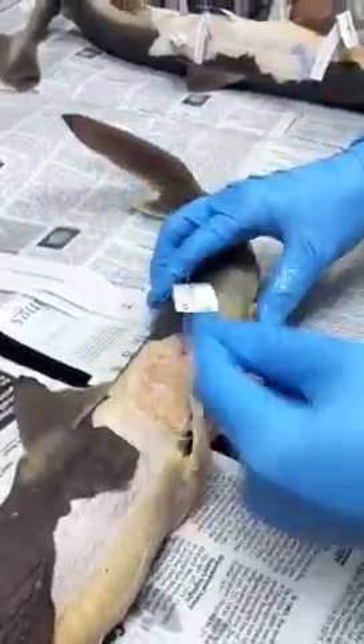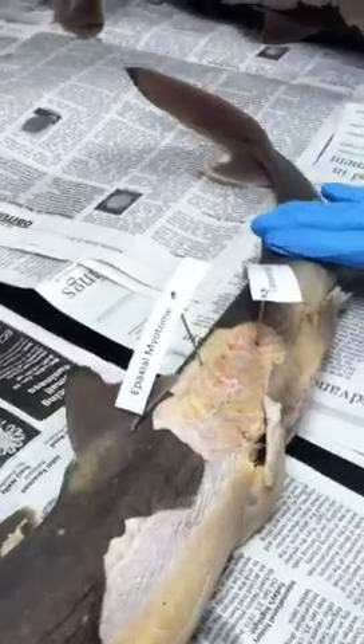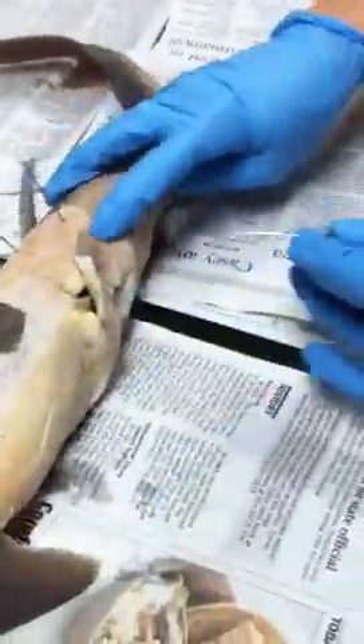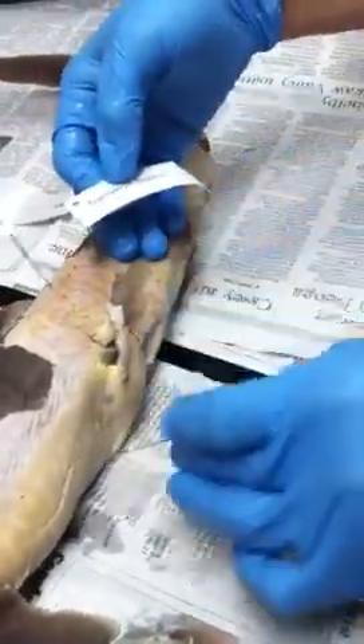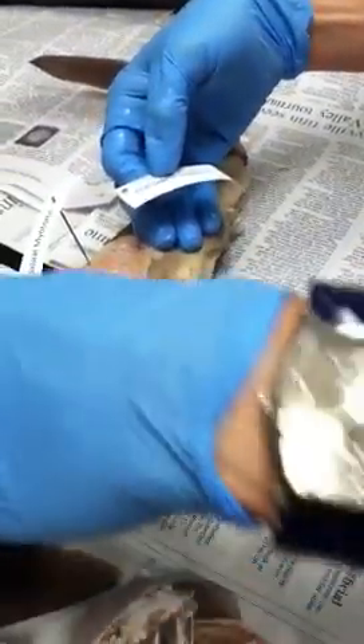Anything above the transverse septum is going to be epaxial muscle. So there are the epaxial muscles — above the transverse septum. Now I go below the transverse septum, and that's the hypaxial. I can pin the hypaxial muscle here or here — as long as I'm below this line, it doesn't matter where I pin it.